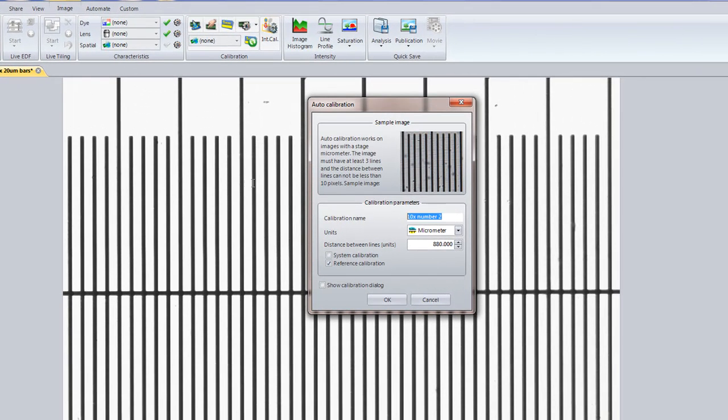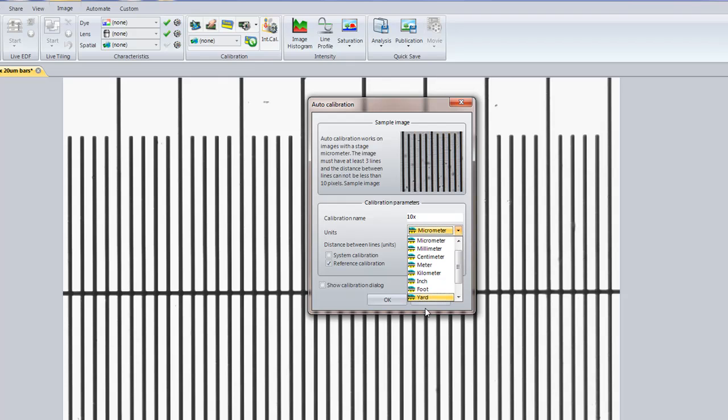Simply enter the name of your calibration. I'm going to call it 10x. Choose the correct units. In this case, it's micrometers.